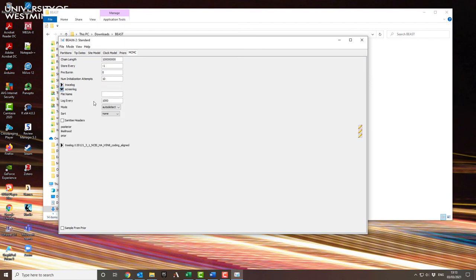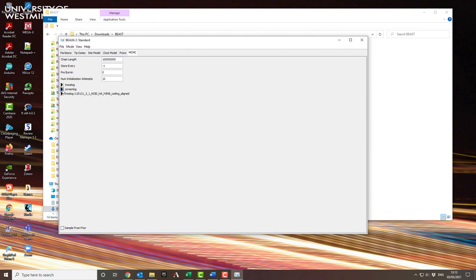And when you're doing that, you also want to increase the screen log, so how often it publishes something to the screen saying it's done a calculation by tenfold, because otherwise you'll see lots of things flying past you on the screen. And you don't really want that. You want it only to update you as often as you need. So put that out by ten.